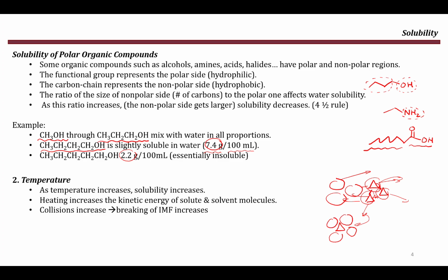Now we are going to use the information which I talked about in these two slides to understand an important purification technique which is used in organic chemistry lab, and it is called recrystallization.